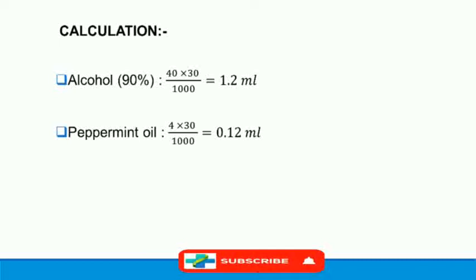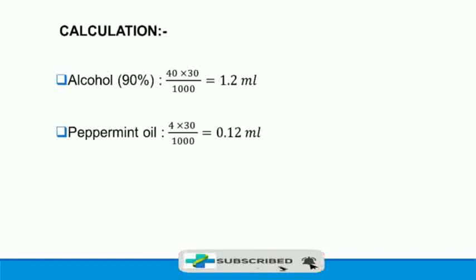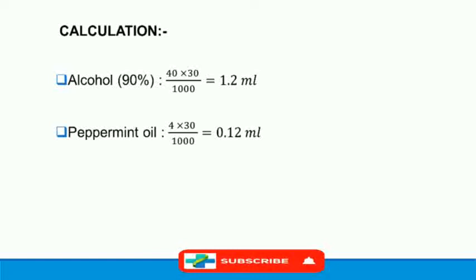And for the remaining amount, to make up the volume to 30 ml, you are going to use glycerin. Already in the last practical I told you that to make up the volume, that is quantity sufficient, is nothing but you are not going to add 30 ml, but you are going to add the remaining amount which is required to make it up to 30 ml.